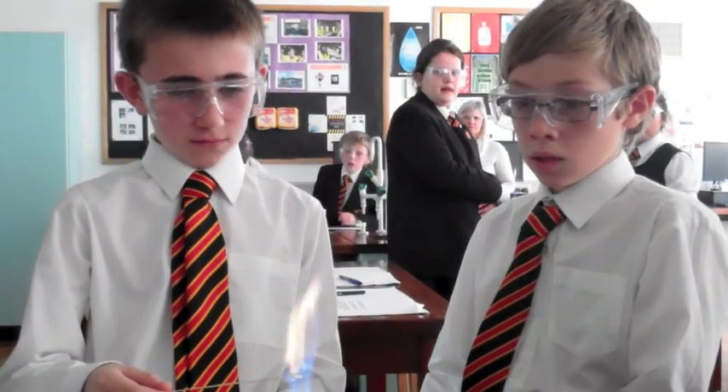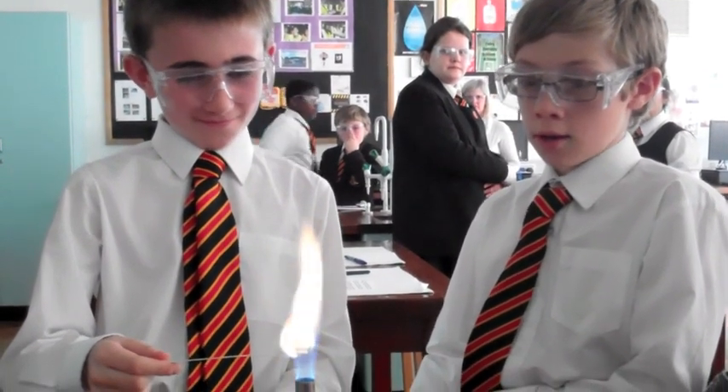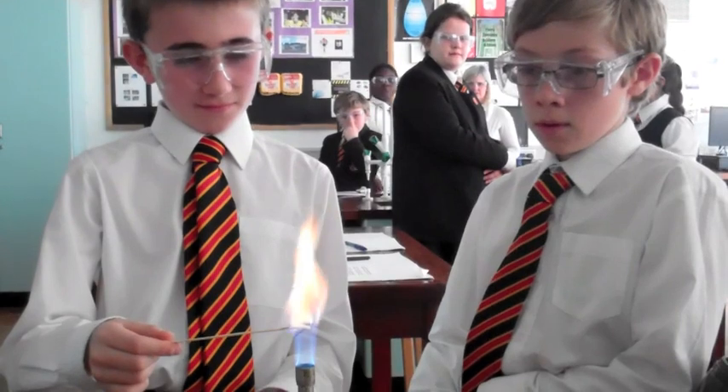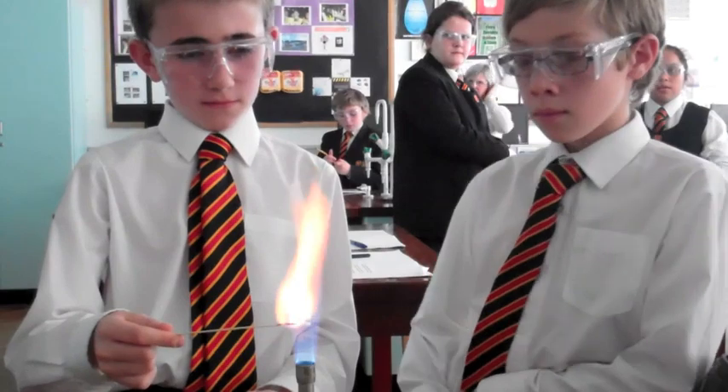What colour is your flame? It's like a yellow colour. Yellowy green isn't it? Yes. There's a green tinge there as well. And what is your salt then? Barium. Barium, ok.